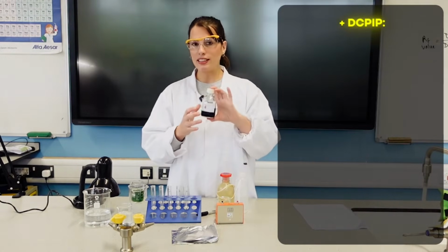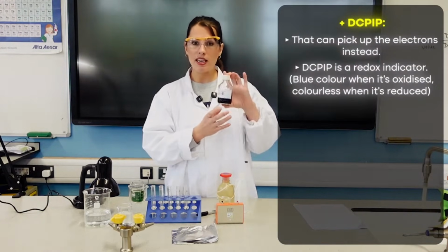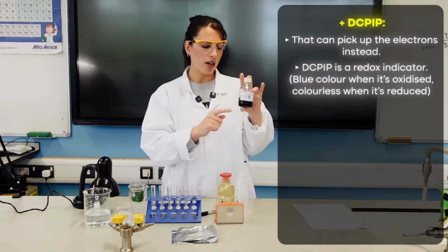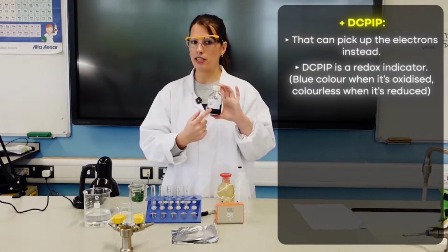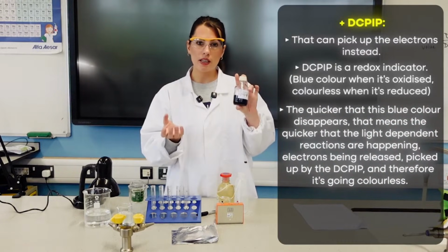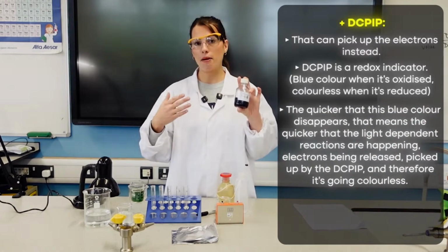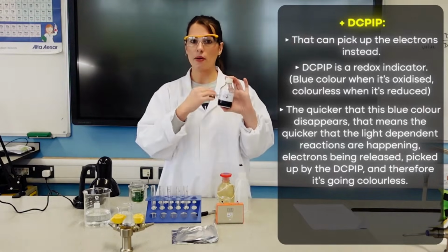But when we add our DCPIP, that can pick up the electrons instead, and DCPIP is a redox indicator that will go from this blue color when it's oxidized, to colorless when it's reduced. So the quicker that this blue color disappears, the quicker the light dependent reactions are happening, electrons being released, picked up by the DCPIP, and therefore it's going colorless.